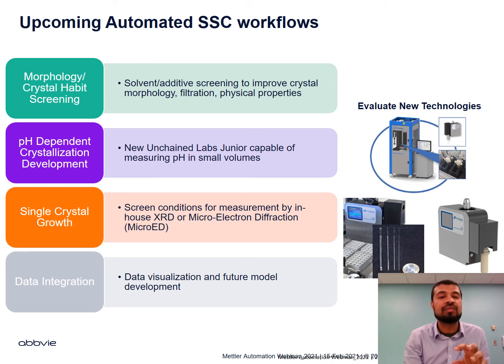And then lastly, all our information management system, which Shashank has shown, is fully application agnostic. It doesn't just apply to, let's say, catalysis or organic reactions. The same workflow we can use for solid state, and I will show later that the same workflow we can actually use for the Mettler or medium throughput experimentation workflow as well. So that's the beauty of some of these information management tools.